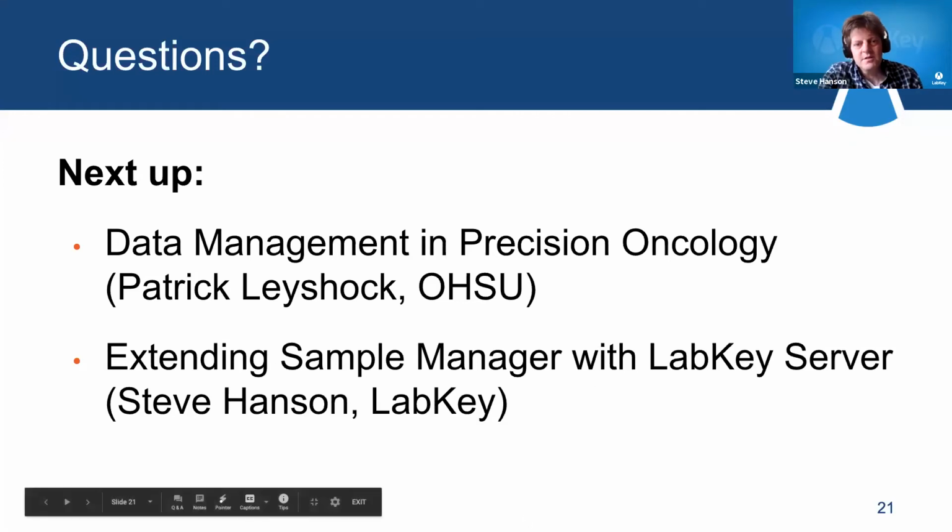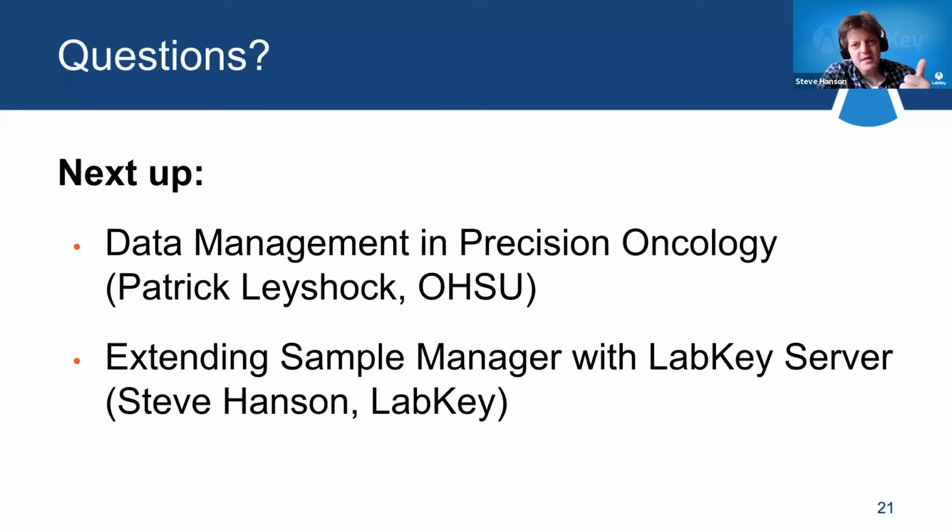And okay, there's a couple more questions here. This may be a question for Matt Y, if he's out there. Tell us about your approach to capture user feedback while developing. Yeah, so we actually work with a Sample Manager pack that consists of a variety of different types of scientists that help us capture what those user requirements might be.